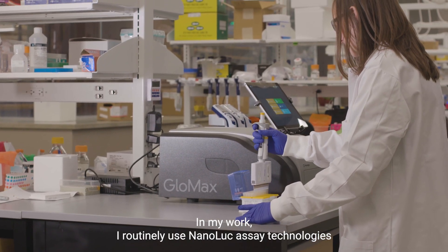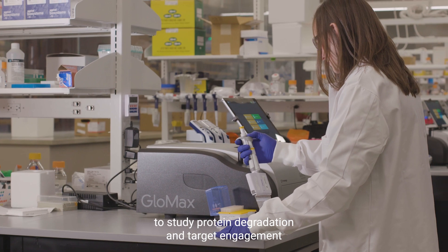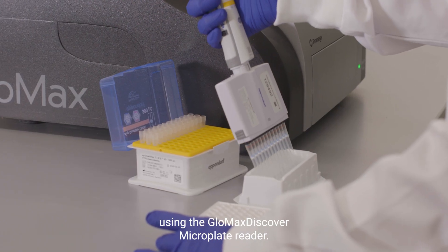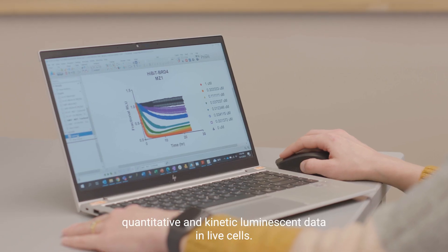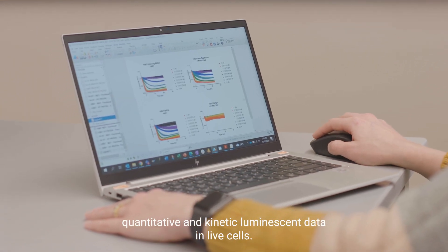In my work, I routinely use Nanoluc assay technologies to study protein degradation and target engagement using the GloMax Discover Microplate Reader. These assays are really powerful because they generate quantitative and kinetic luminescent data in live cells.